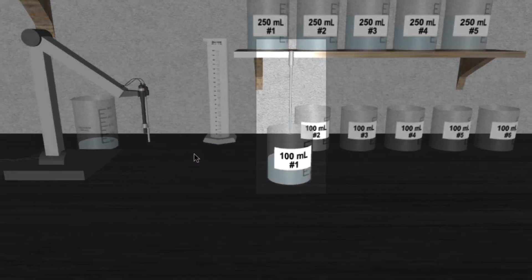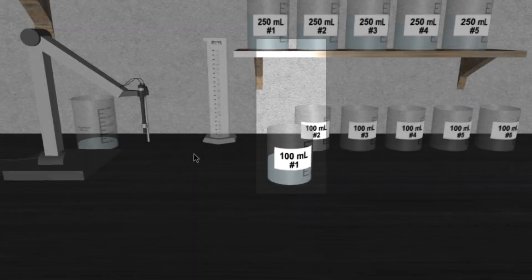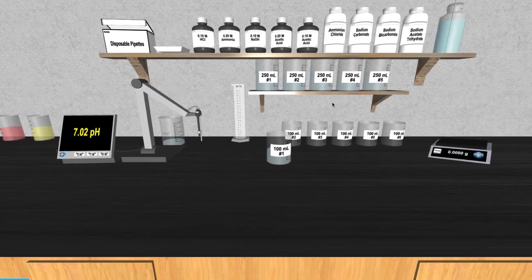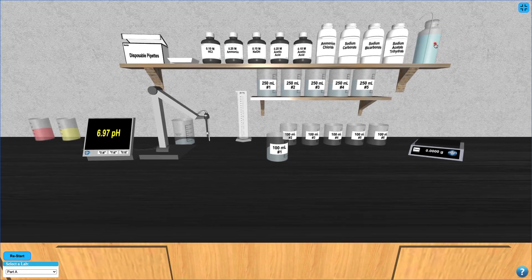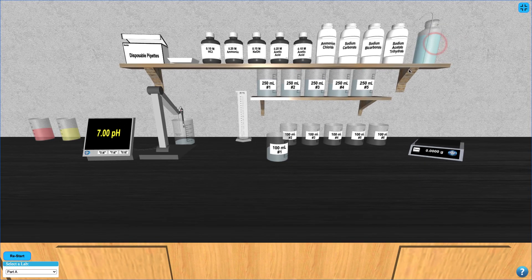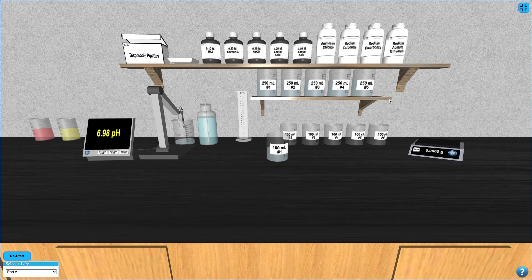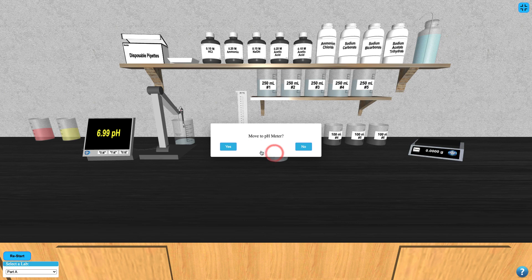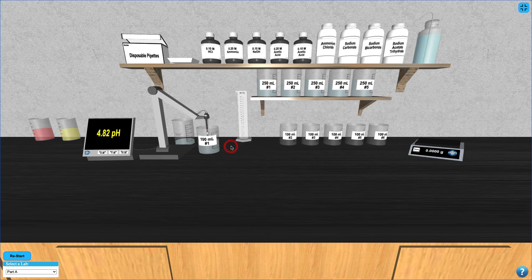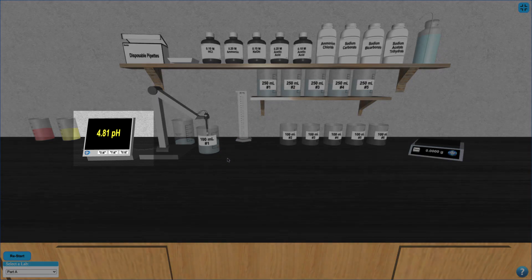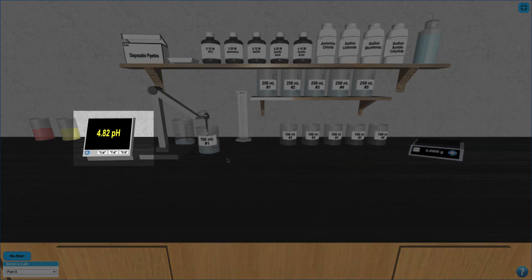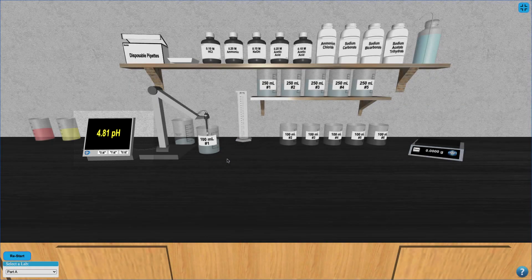Now you can rinse the pH electrode with deionized water before moving your beaker to the pH meter to take another reading. Repeat these steps for each of the six required pH tests.